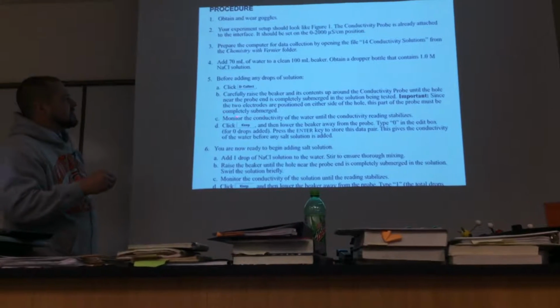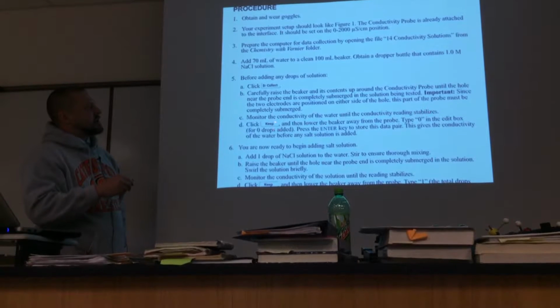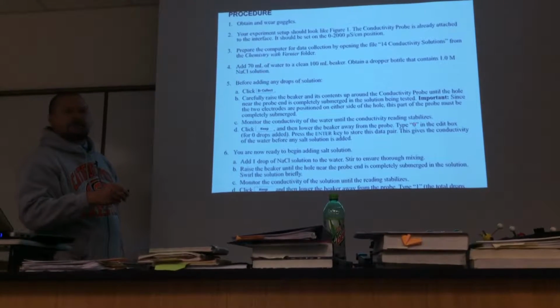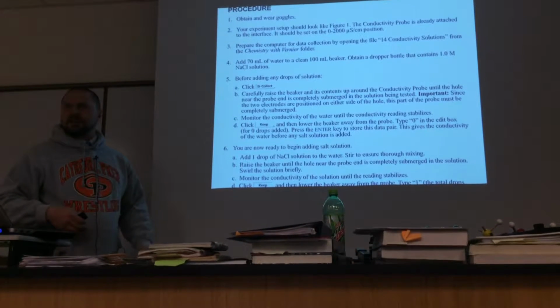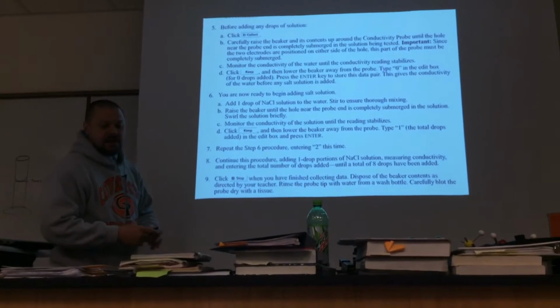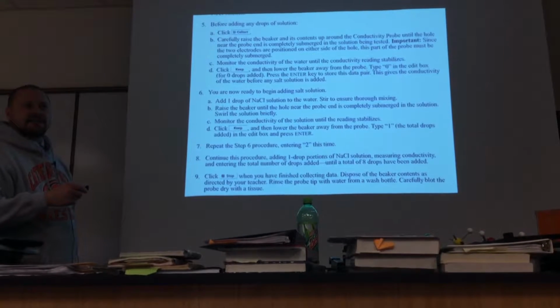And once you watch the conductivity, once it stabilizes, you're going to hit keep. Then a little box is going to pop up, and you're going to enter 0, meaning you didn't put any drops of the salt in yet. Then you're going to take the beaker away, and you're going to add 1 drop of the salt solution. And I'll show you that a drop is actually a kind of a scientific thing.